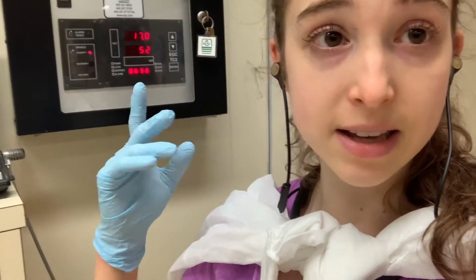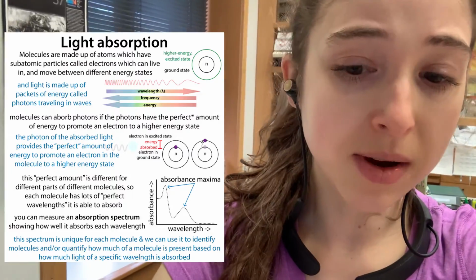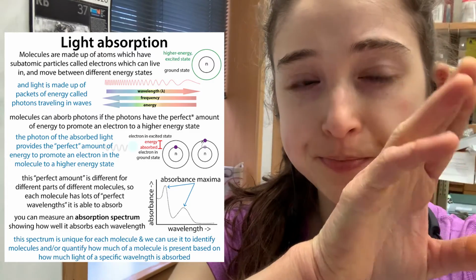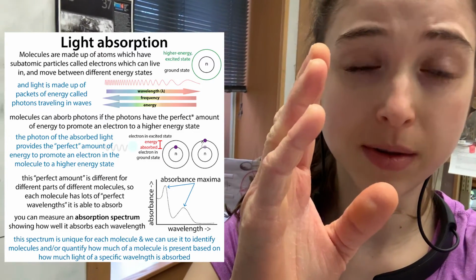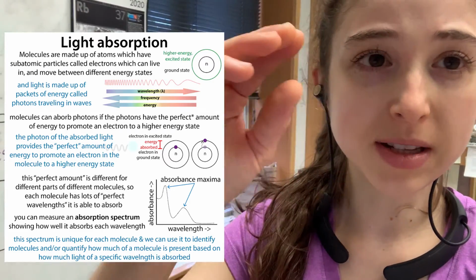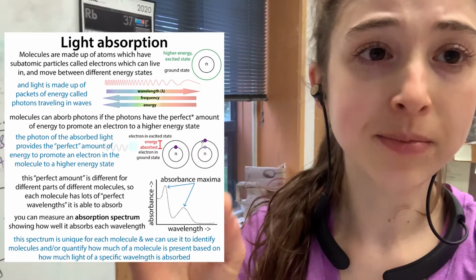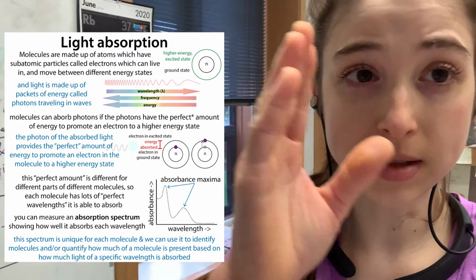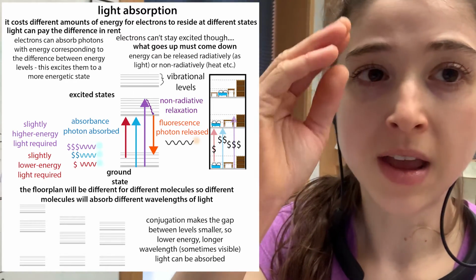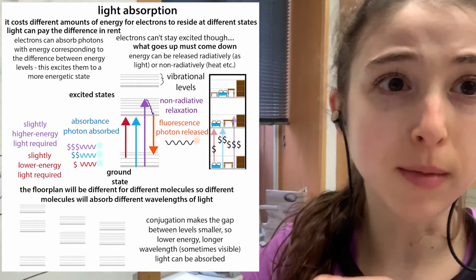So we look at 260 to get the extinction coefficient. You can see that the highest absorbance is at 260, and that you have an absorbance spectrum, like a big curve, instead of just a single peak. That's because the absorbance is going to depend on the electrons being excited. More about this in a minute. Basically, different parts of the molecule will have electrons that can get excited by different wavelengths of light. So within that same molecule, you can have absorbance at multiple wavelengths, and then there's some fuzzy wiggle room with vibrational levels as to how much energy those electrons need in order to be promoted to a higher energy state.